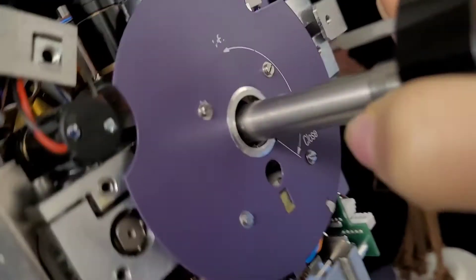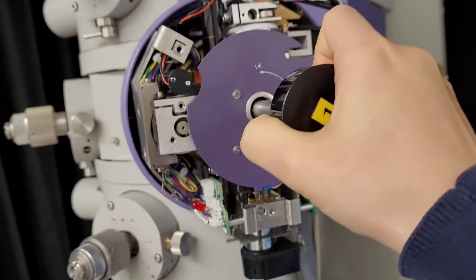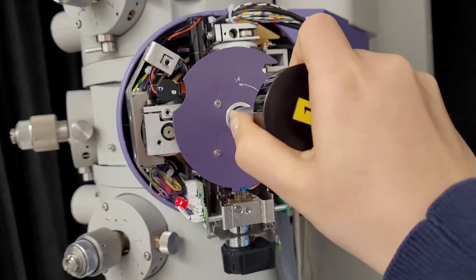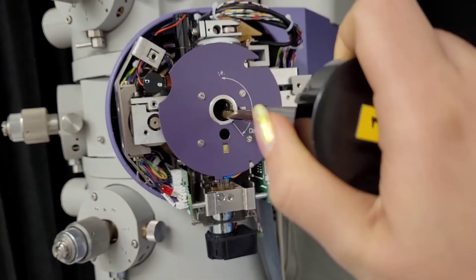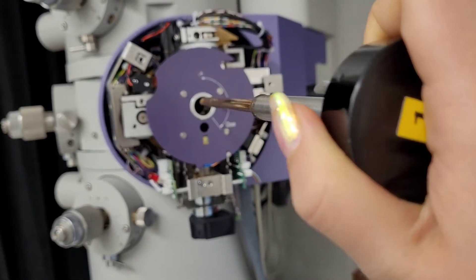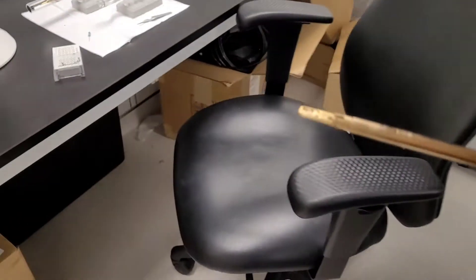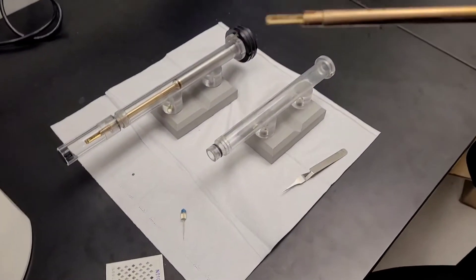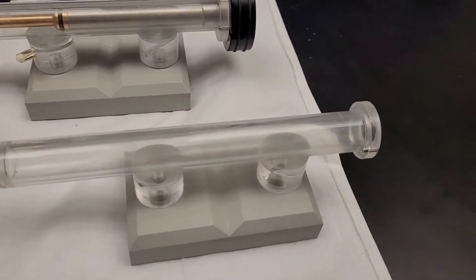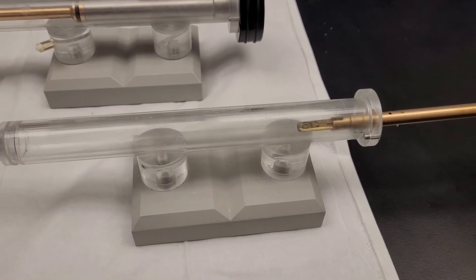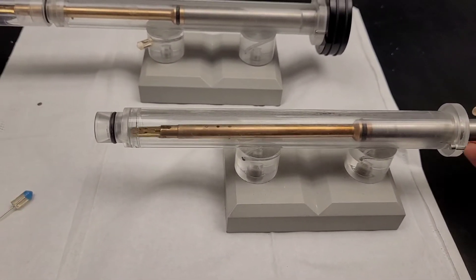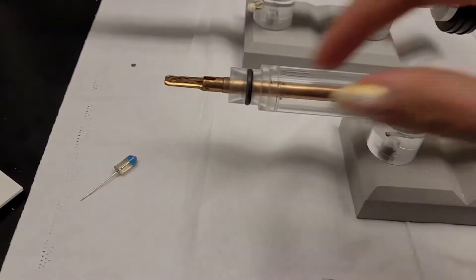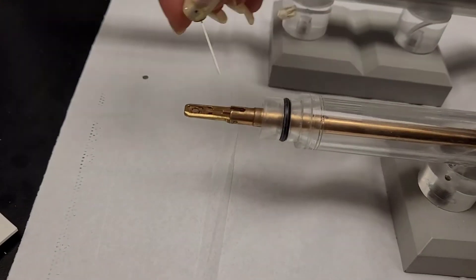After you twist it clockwise, you're going to reach a point where it stops. Then you have to continue taking it out towards you, but make sure when you're doing that you do not touch the tip of the probe and you will not break it. It has to be done very carefully and in a gentle way.